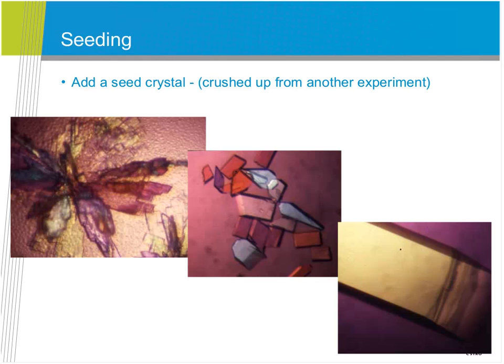And then this is an example from Therese Bettiforsch, which is showing how you can improve the quality of your crystals by going through rounds of sequential, sometimes seeding. So she started with these furry things, which are clearly crystalline, but clearly not going to be very useful in the beam, moved through this intermediate, which are probably useful now, but weren't useful with the X-ray technology which was available then, to this honker, which diffracted X-rays from here to Sydney and managed to solve one PhD student's life problems.